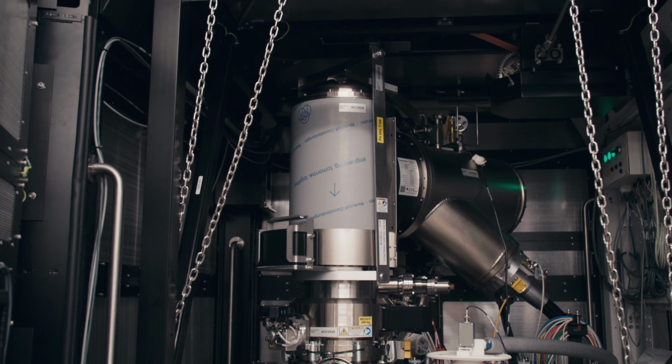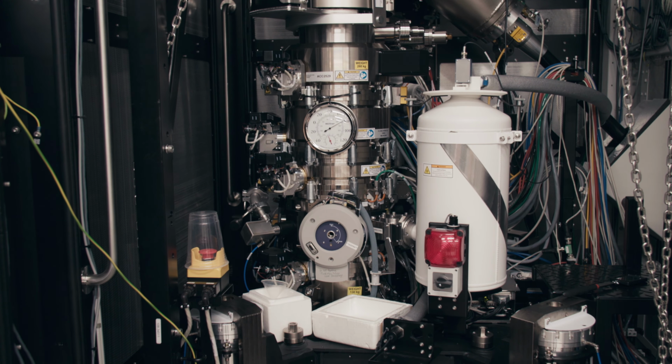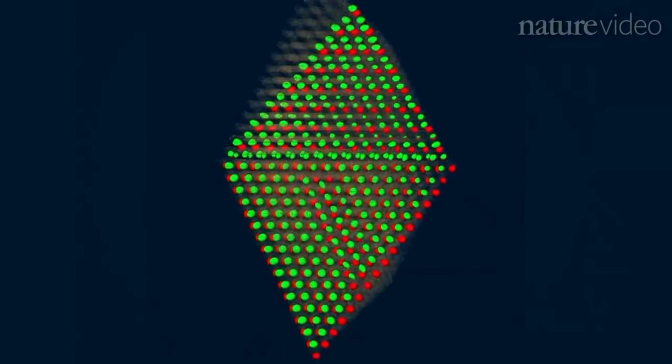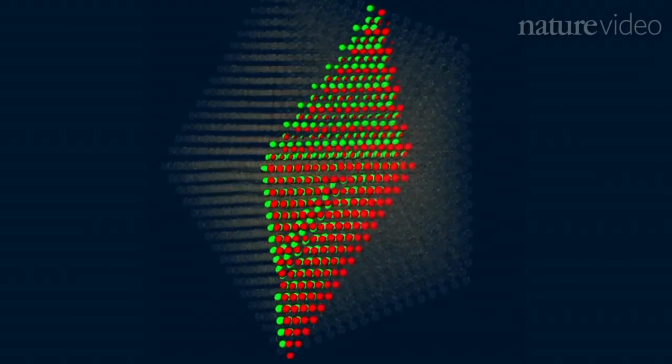In addition to high-resolution imaging and crystallographic structure determination, it can perform a variety of other imaging and spectroscopic modalities. Two of the most common are 4-dimensional scanning transmission electron microscopy, also called 4D STEM, and energy dispersive X-ray spectroscopy, EDS. 4D STEM means taking a diffraction pattern, a 2D object, at every point in an image, another 2D object. With this information, you can determine different structure components from the locations of certain diffracted electrons, or select particular scattering ranges to highlight important contrast.